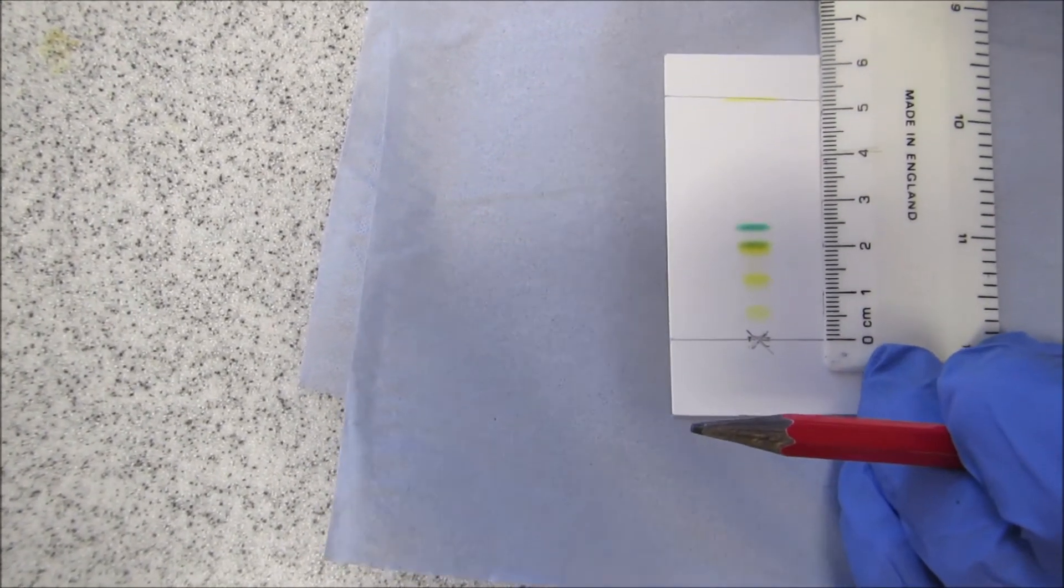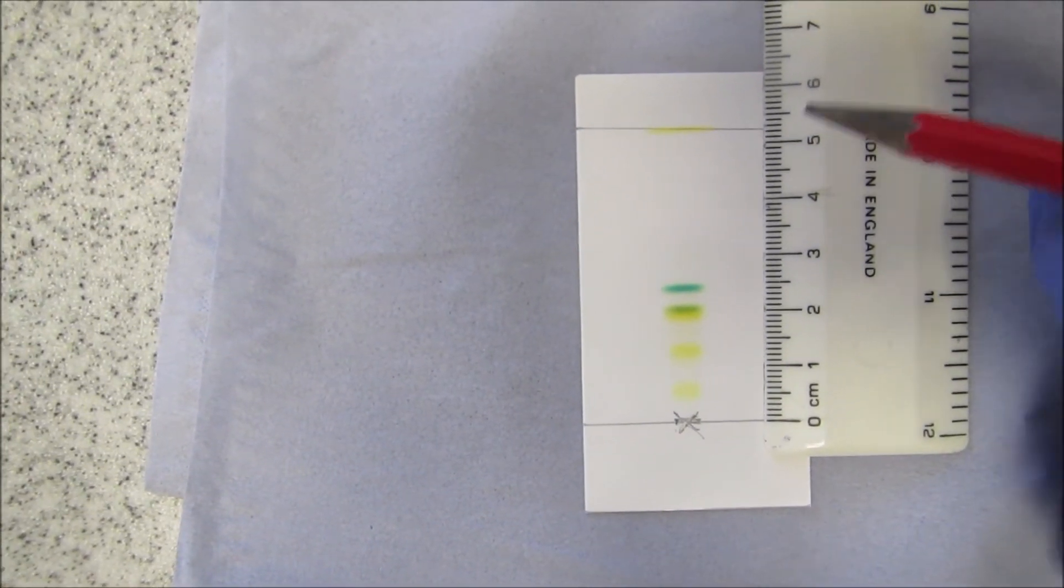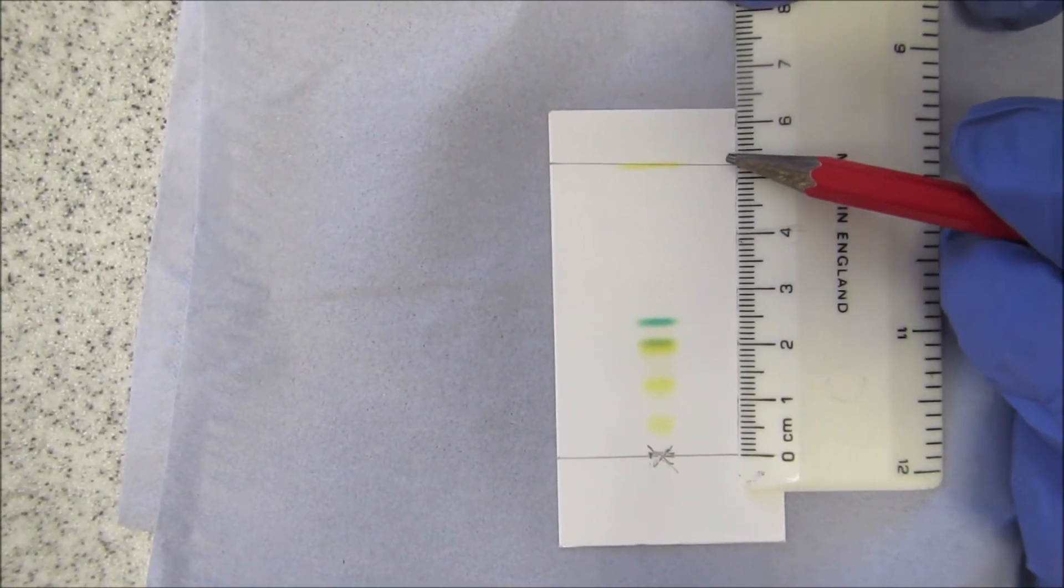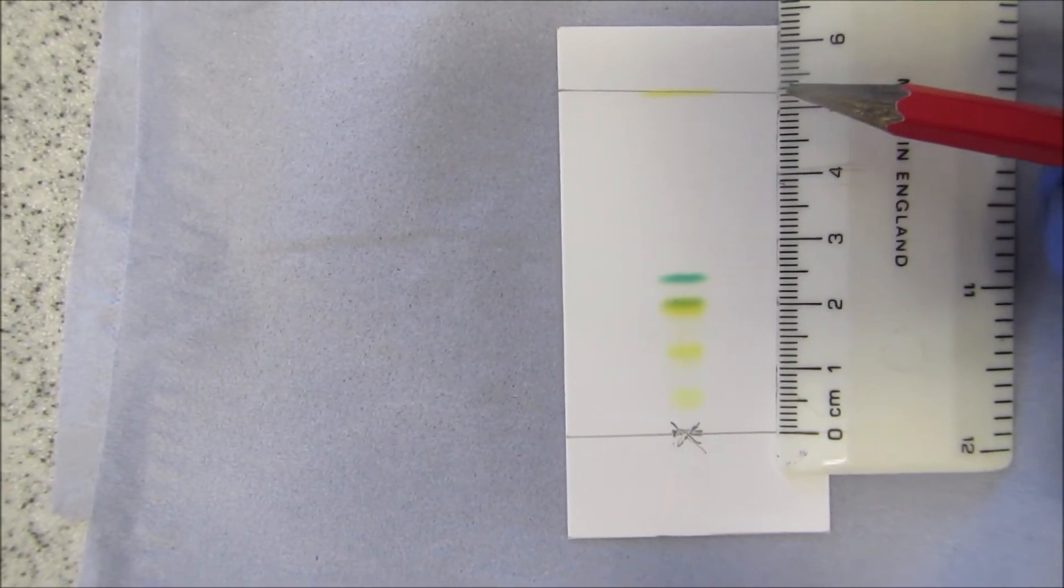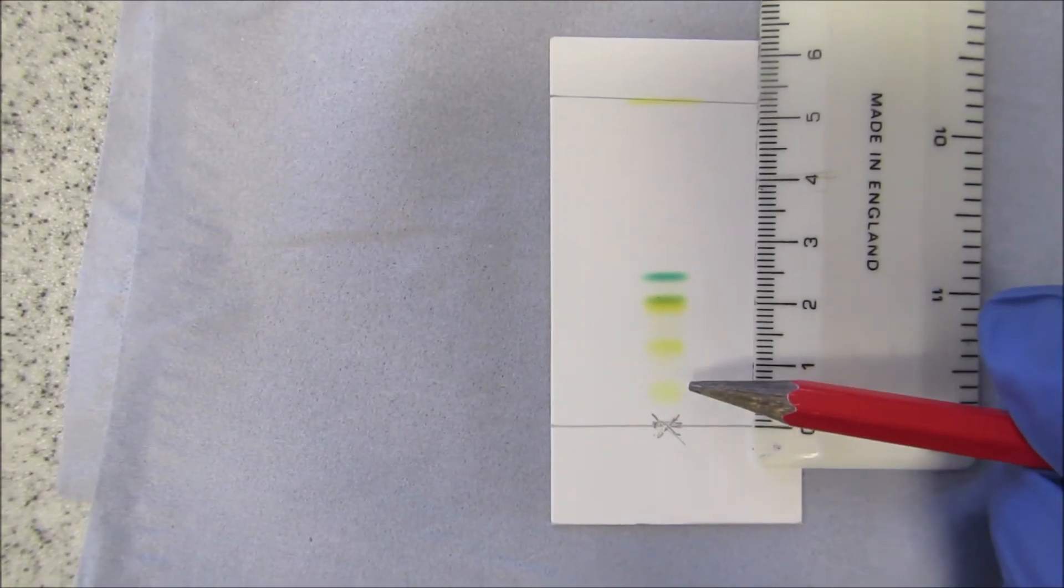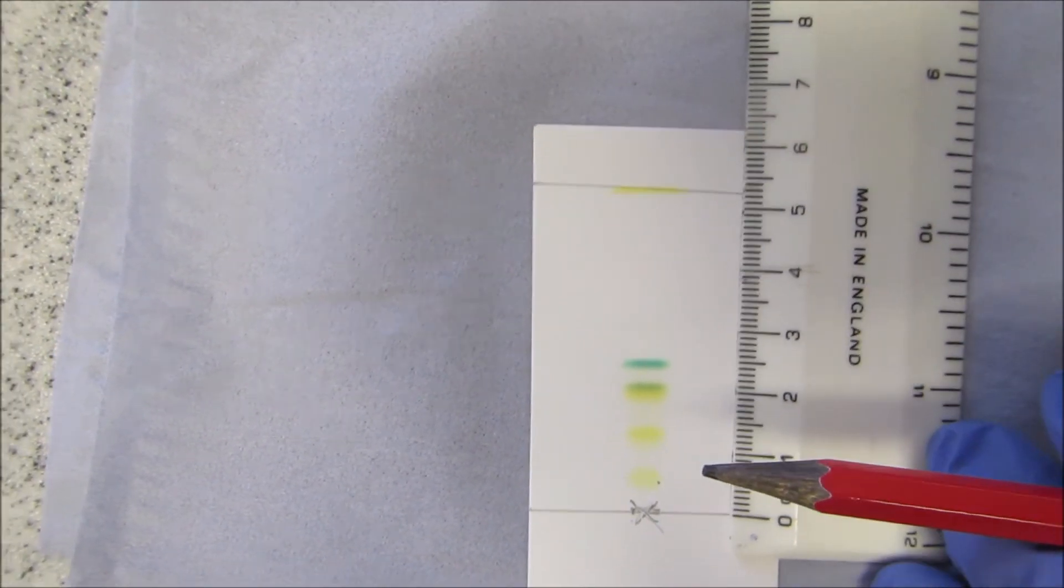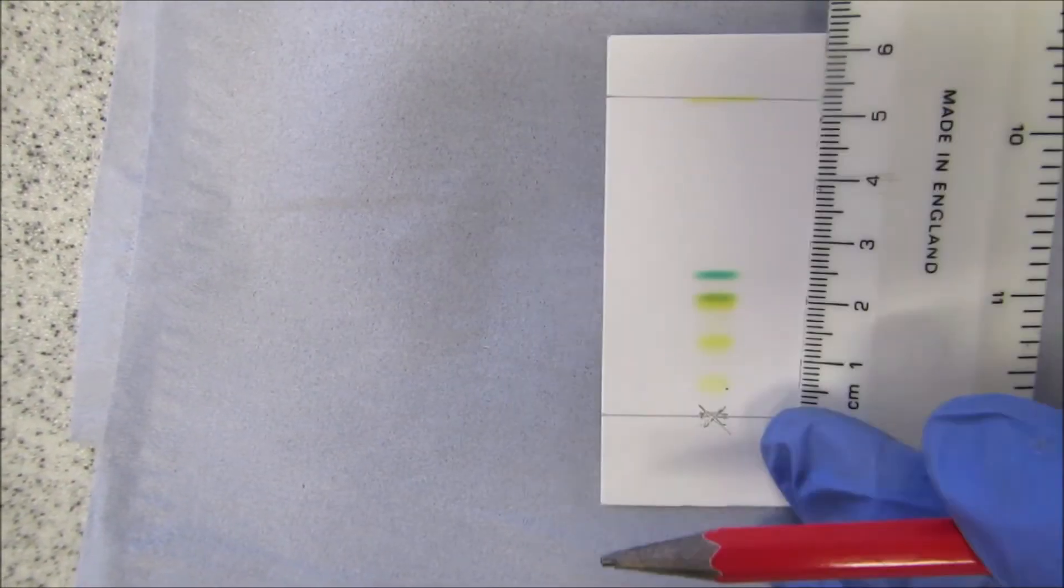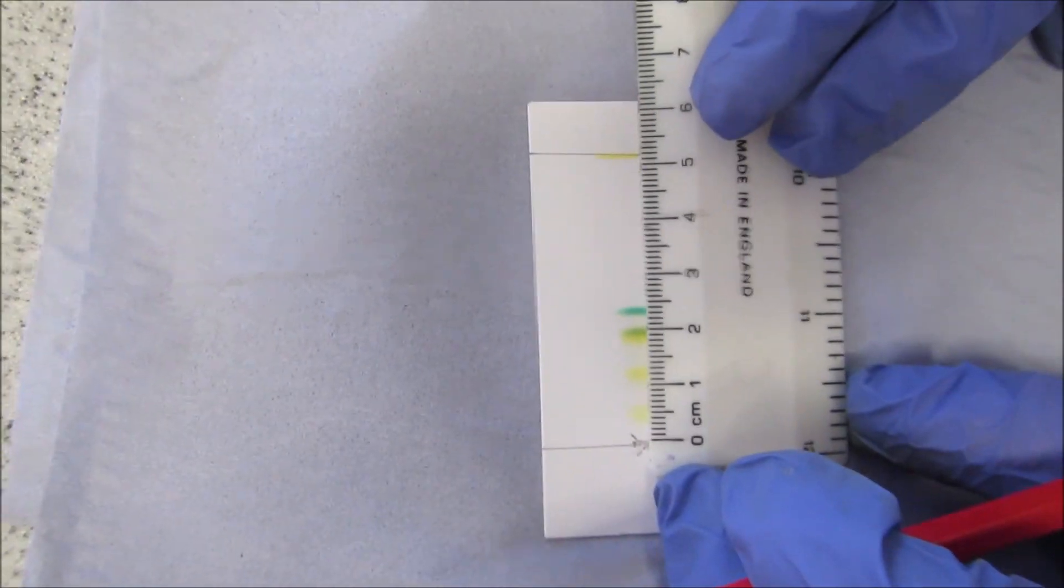So I'll just put a ruler there. You're going to be measuring from the line where it started. And then you're also going to want to measure to where the solvent ran, and that's the bottom one that you divide everything by. But you're also going to want to look at all pigments. So how many do you think there are? And if I move the ruler in, you can then hopefully calculate how far each spot has run.